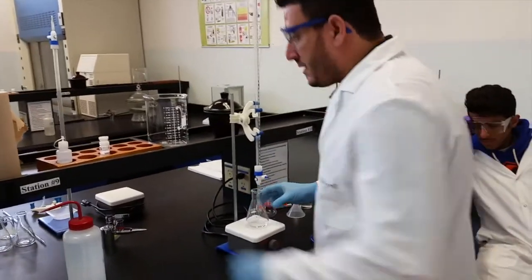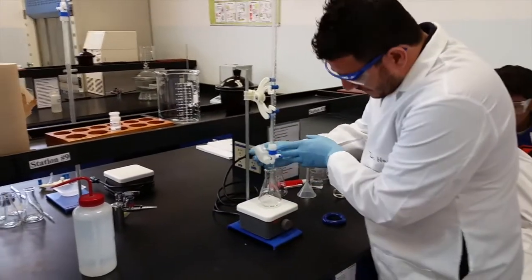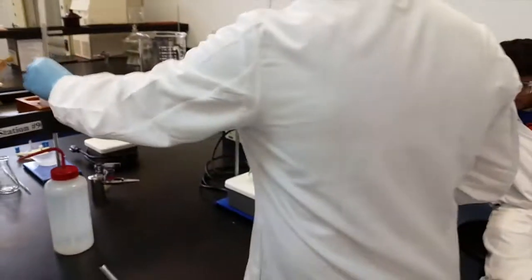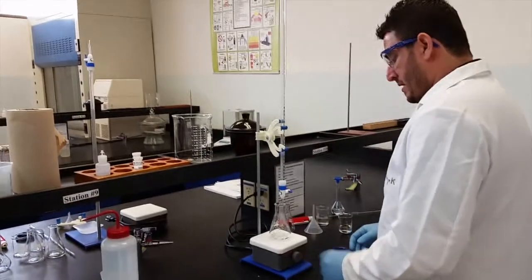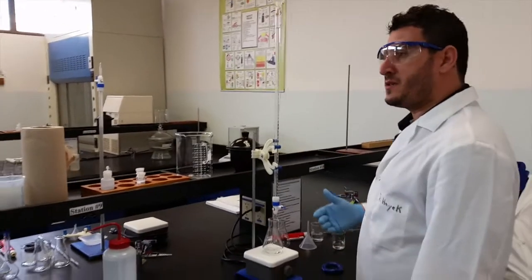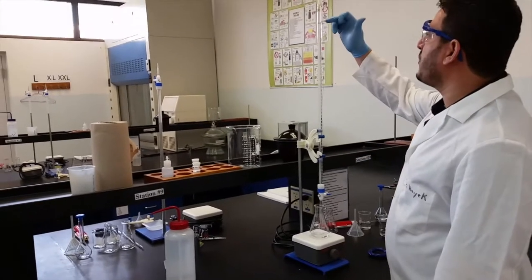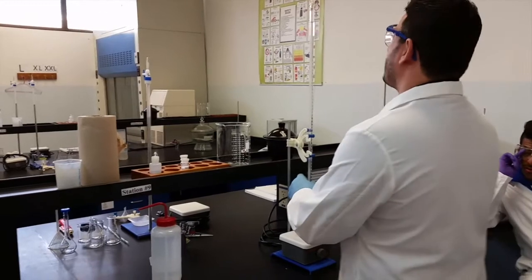Now, as we did for the acid-base titration, we will add 4 to 5 drops of an acid-base indicator, which is the phenolphthalein. The first titration we will do is the rough titer. So I will be adding one by one until the color of my solution changes.